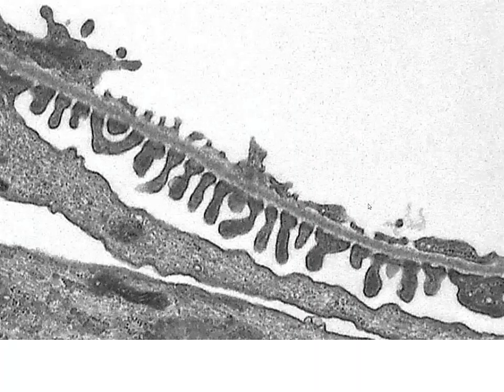Another view of the same endothelium at the top, basement membrane, pedicels, and you can somewhat see the membranes possibly there and there. You don't necessarily see them in each one. But those are going to be our 3 filtration mechanisms that allow plasma to move out into Bowman's space and be our glomerular ultrafiltrate.